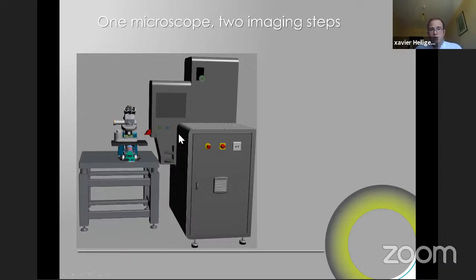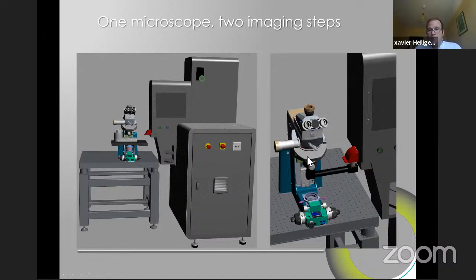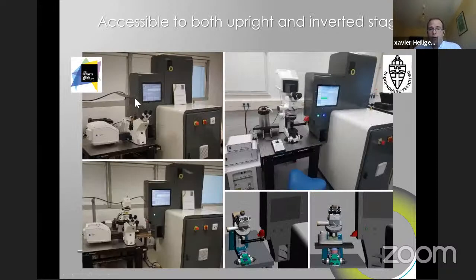And then once you want to do live cell imaging, you put your inverting arm on, and then you can do live cell imaging on an inverted system. You remove this inverting arm, and then you would do cryo-light microscopy. So basically, we become way more flexible nowadays with these different technologies. Depending on which lab you're working with, you have a preference for upright or inverted microscope, but it's not only a preference, it's also where you want to focus. Here in that case, at the Francis Crick Institute, what they want is to do live cell imaging, which is the most critical step. So they want to see things live.